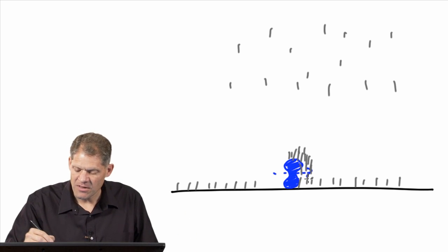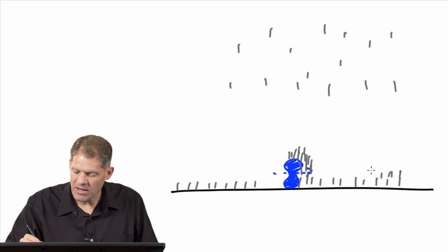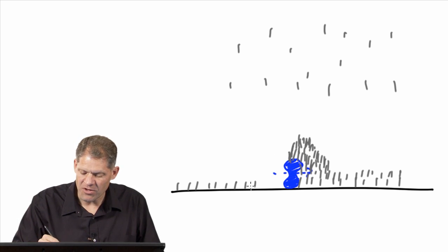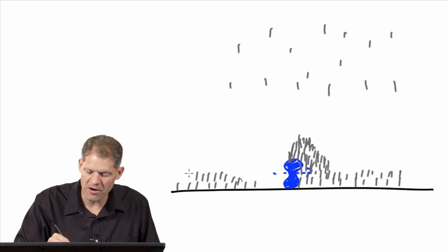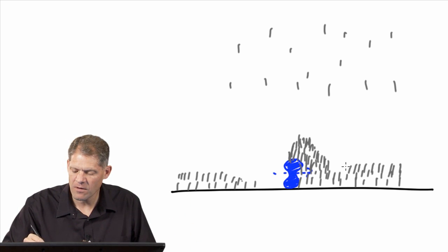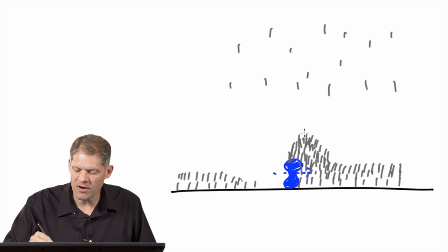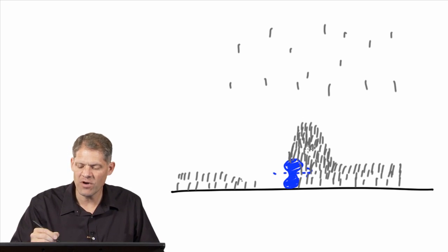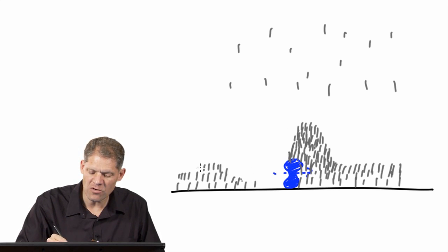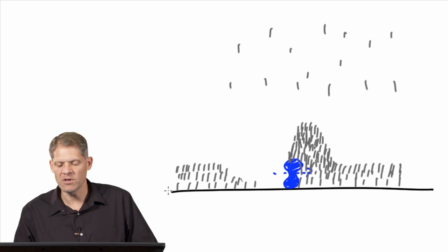Then the next round, this will happen again, and so it'll get a little deeper all over the grid, but especially deeper right in front of our object. And as this gets deeper and deeper, the shadow that it casts will get longer and longer. So then another layer might come on like this, and then there's a very large amount of metal that will build up in front of the object, and that'll cast a very long shadow, so the third coating only goes like that.